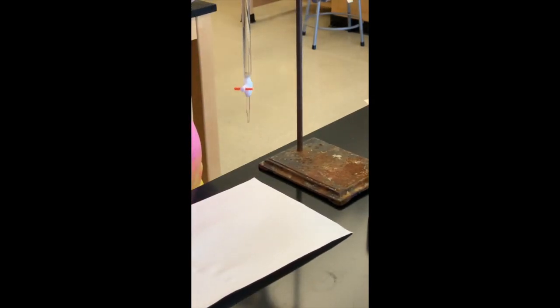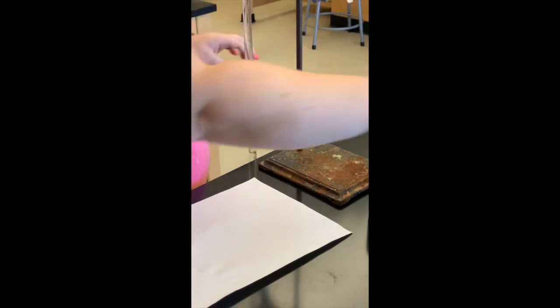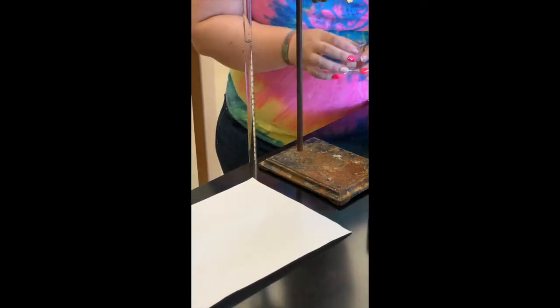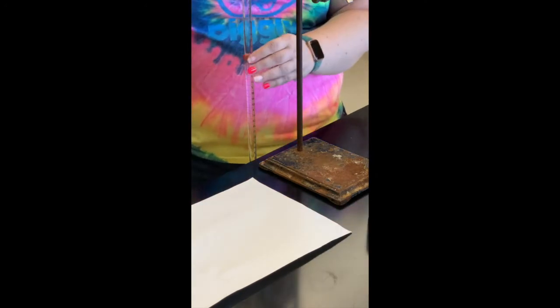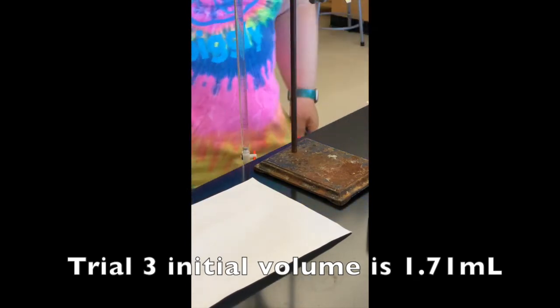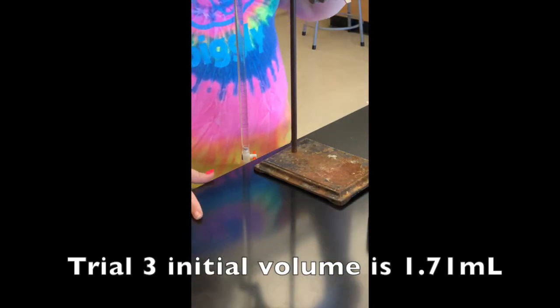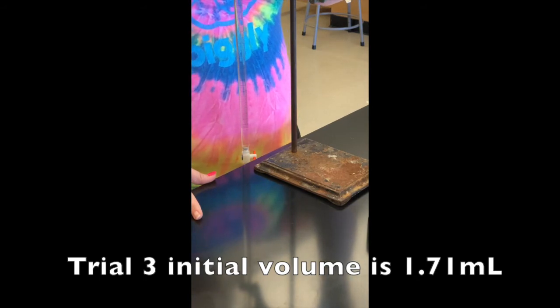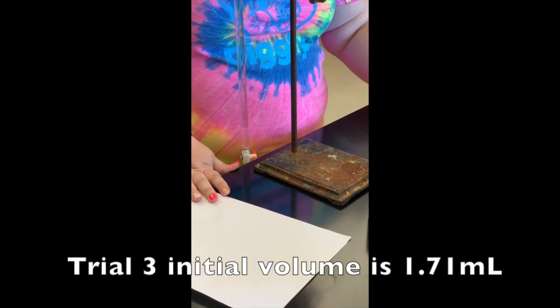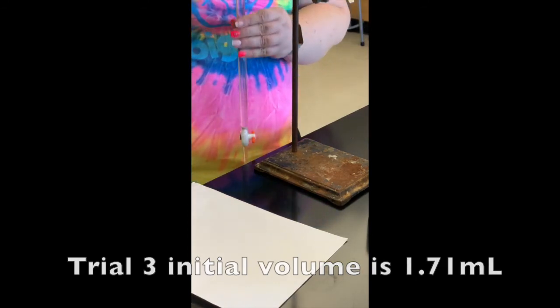I lowered it off the edge of the table so I don't have to do anything above my head. I used a funnel and poured from a small beaker so I could have the most control possible. Now I can take my initial volume for trial three — filled it up pretty close to the zero mark, not quite there. The initial volume for trial three will be 1.71 milliliters.